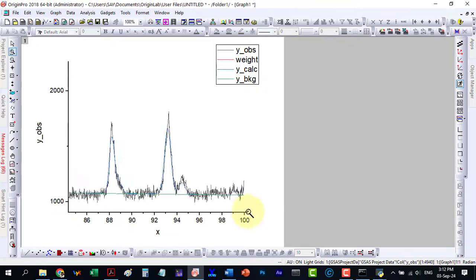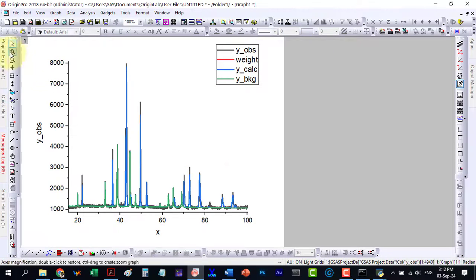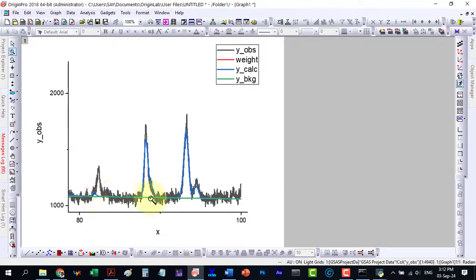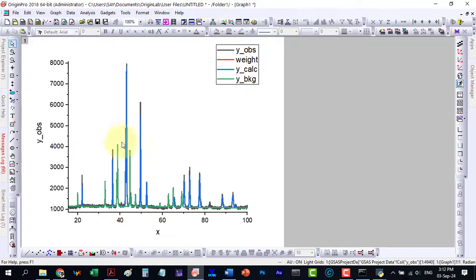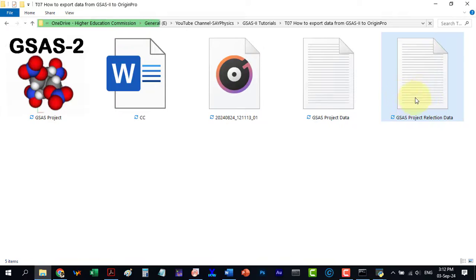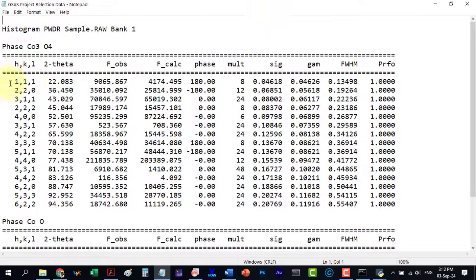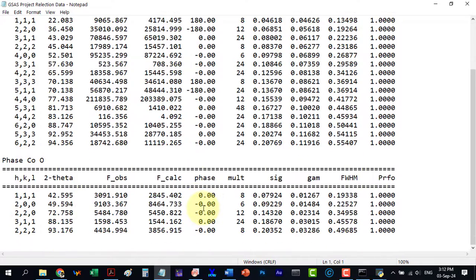The plot can be customized as needed. Additionally, to display the reflections or index with hkl planes, we can retrieve the necessary data from this file.